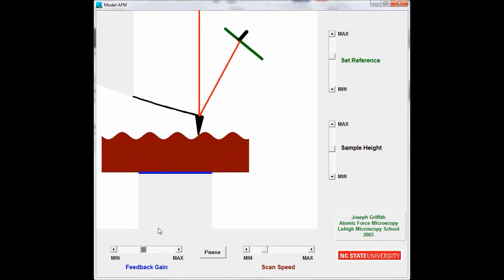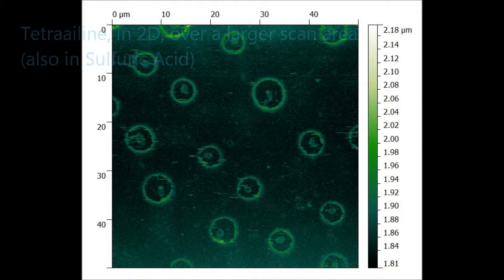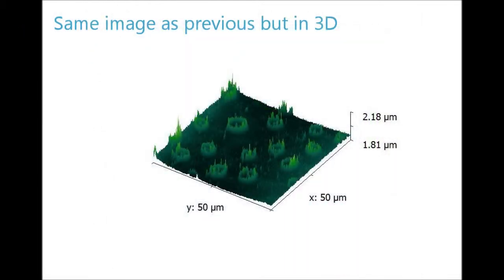The way the force is measured is done in a number of ways. The main processes are either measuring how much the cantilever moves as it is dragged across the surface, or measuring the force of interaction with the surface. In the second instance, the tip does not actually touch the surface, but at the scale it is working on, the atoms put forces on each other, and this is what is measured.